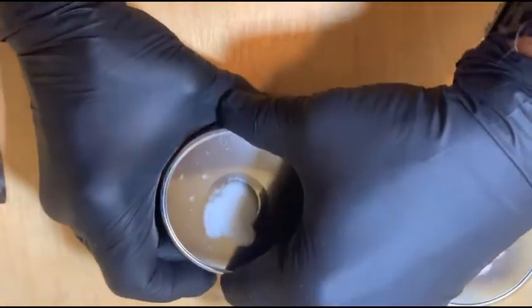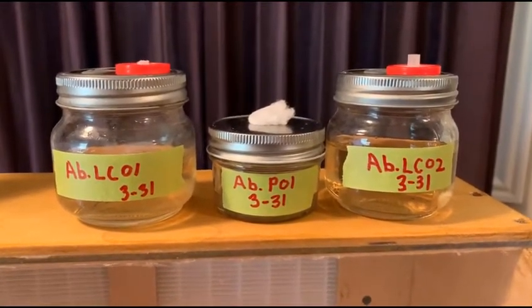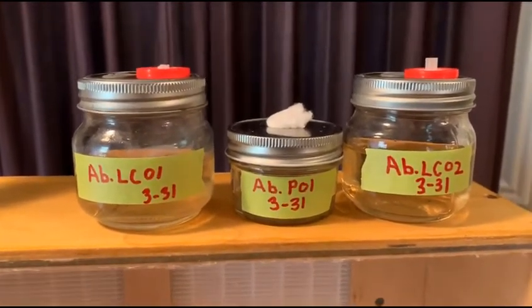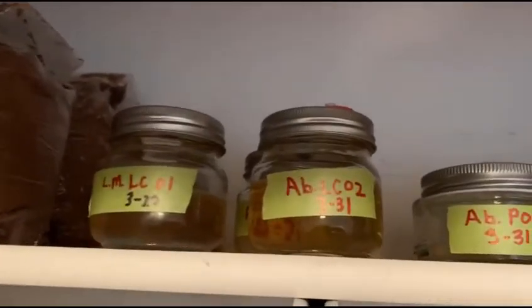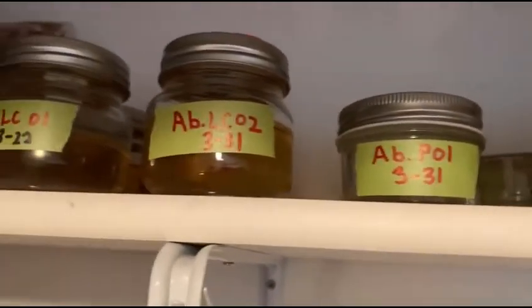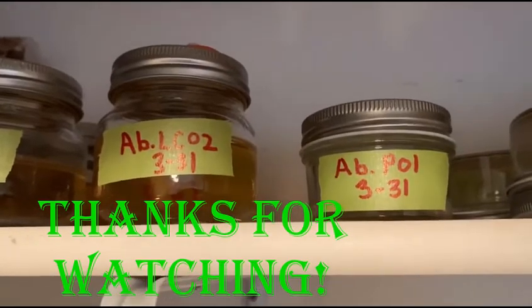And that's it. I'll throw some labels on these, and we'll let them culture for a week and take a look. Here's the results of a few minutes' work — we have two liquid cultures and one agar plate of Agaricus bisporus, which is the common white mushroom. They go up on the shelf in my closet. I'll leave them for a couple of days, then stir them and leave them for a couple more days, and so on. The plate I'll just leave alone for four or five days and then take a look.